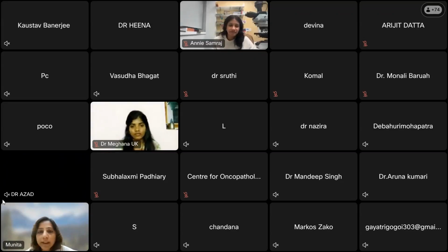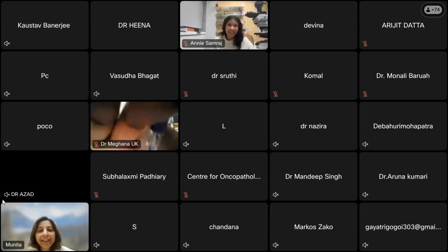And for lymph node assessment, I am very particular about the lymph node yield. So I try to emphasize that we regross. And because we do axial slicing, you have to see that you're not overcounting, like you mentioned.